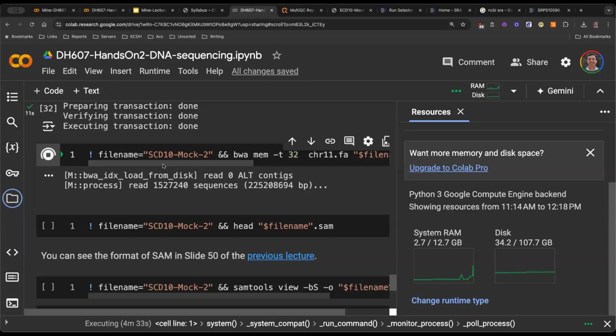So BWT is already done. It's just doing the alignment step, figuring out where the alignment should happen. When it loads things into memory, it actually doesn't load the entire index, because it takes that binary kind of approach. Why load everything? Let's start from the smallest things that we read. If we don't find anything in there, then we load the next chunk and so on. So that's what happened here.